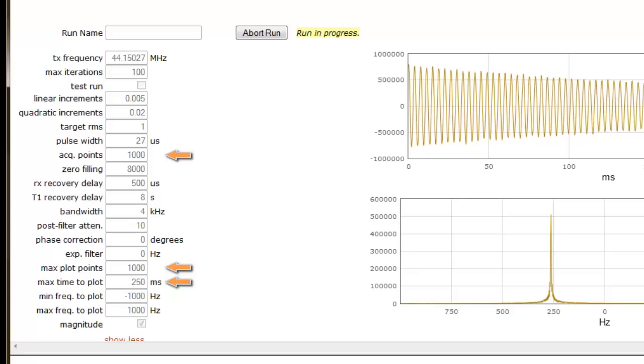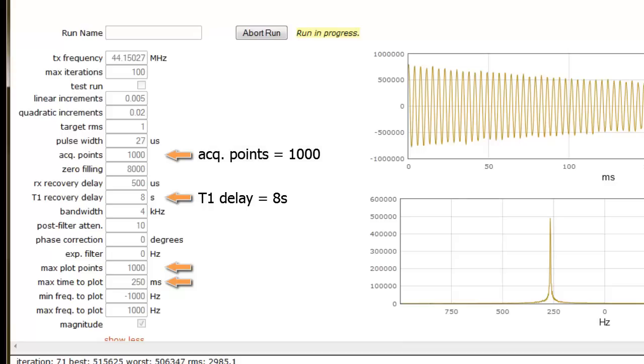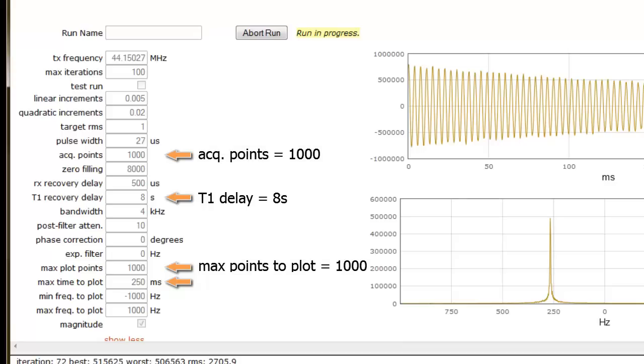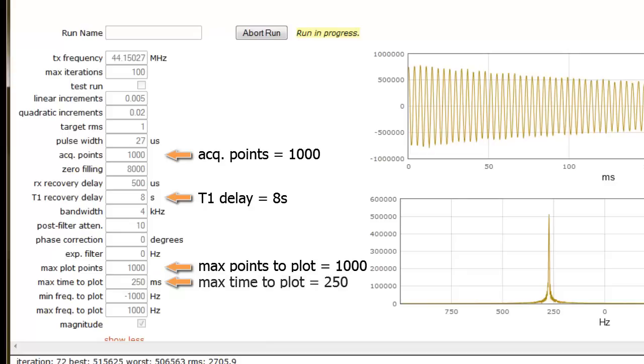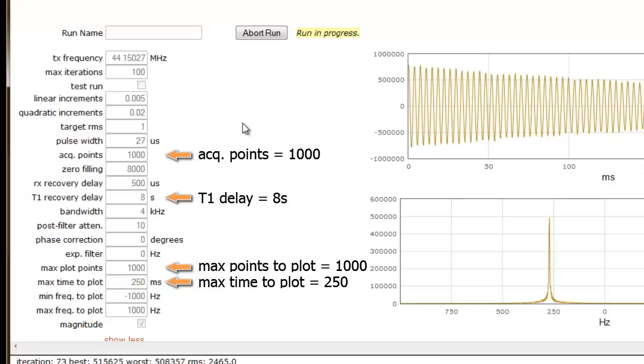For shimming, the T1 delay should be set to 8 seconds, acquisition points to 1000, maximum points to plot can be set to its maximum value of 1000 points, and the maximum time to plot can be set to its maximum value of 250 milliseconds. Setting these values properly will prevent the script from experiencing process extension delays.